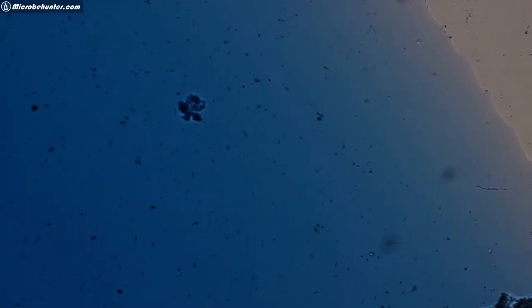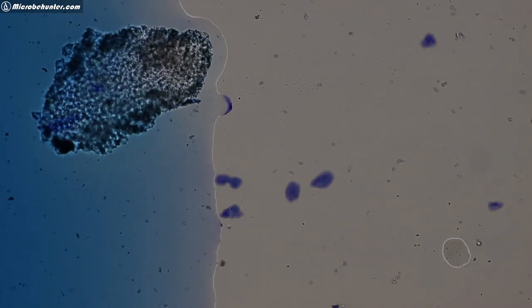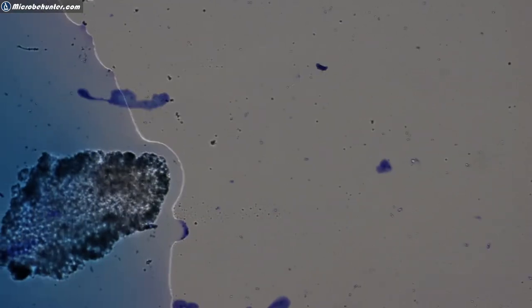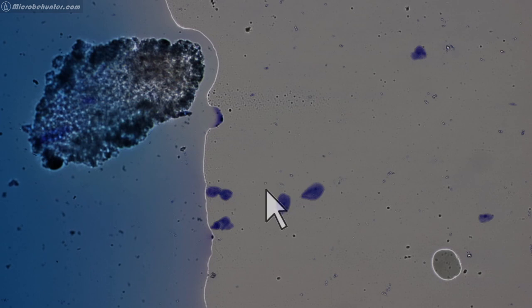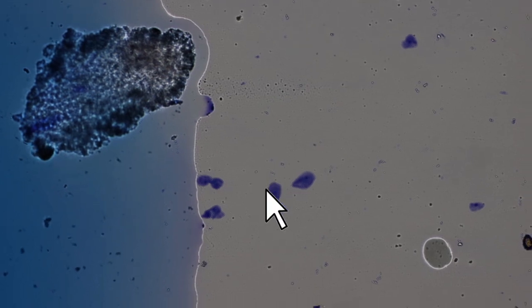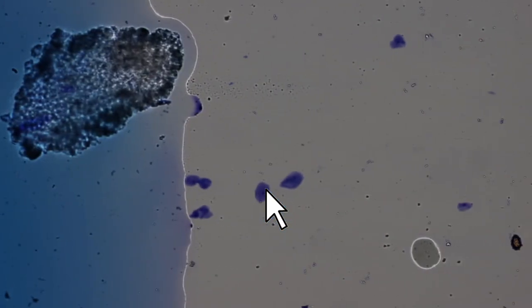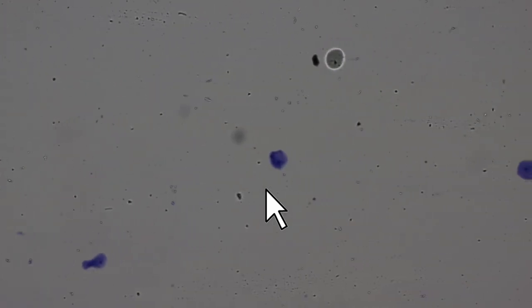Okay, let me see where is it? Where are the cells? Here might be some of the cells. No, I've got to find something interesting first. Look, that's interesting. This is something that I also cannot fully explain. Look at those cells here. That's actually quite interesting. Those cells here, they are already stained, but the stain did not even reach them yet. How is this possible? No, seriously, I don't know.